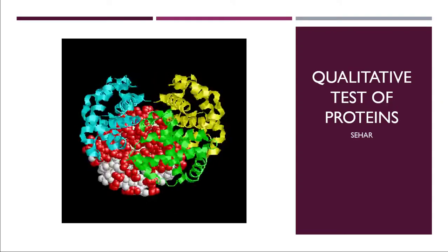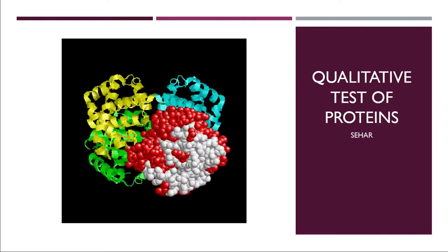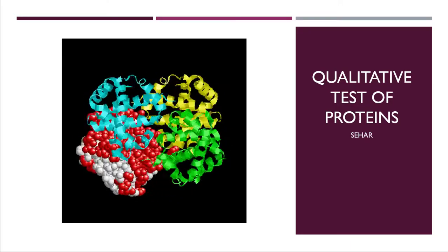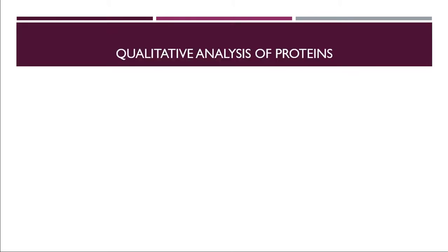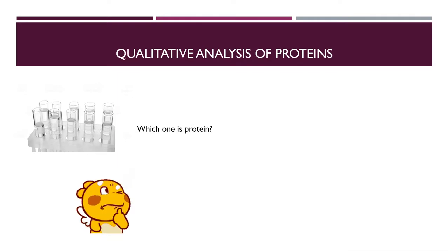Hello, this is Sahir from EZPZ, and the topic we are going to discuss today is qualitative tests for proteins. To do the qualitative test, we are taking a group of test tubes here, and we need to know which test tube contains proteins. This is really hard because all the test tubes are colorless in nature.